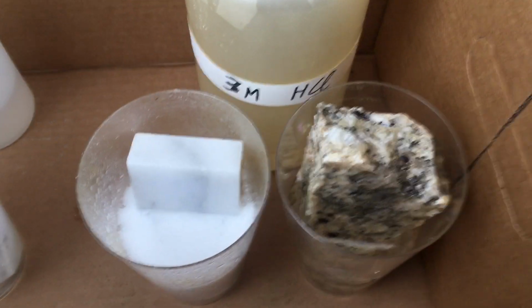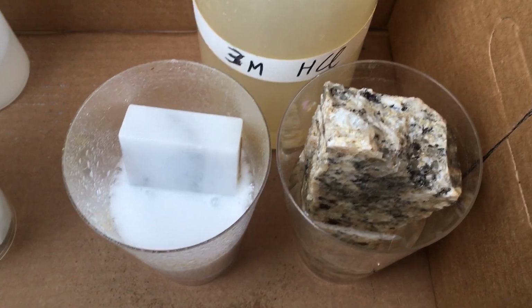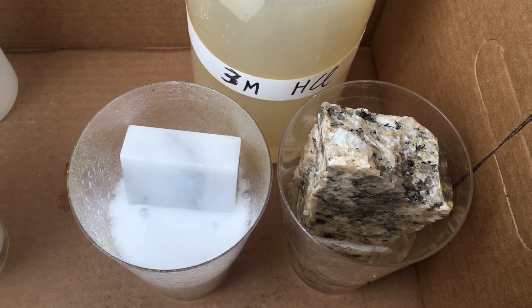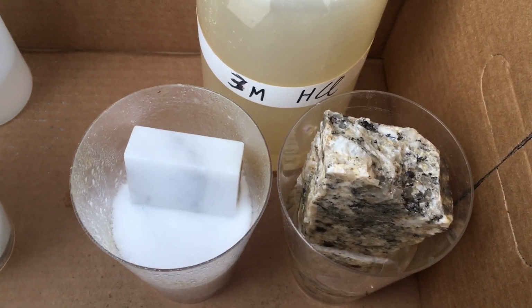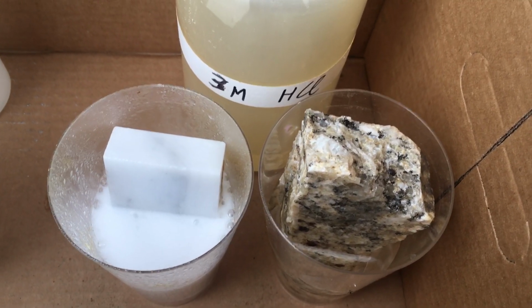Alright, you can see the aluminosilicate is not reacting, the granite is not reacting with the hydrochloric acid, but you can see that the hydrochloric acid and the marble are vigorously reacting. That calcium carbonate is reacting with the hydrochloric acid to produce carbon dioxide gas.